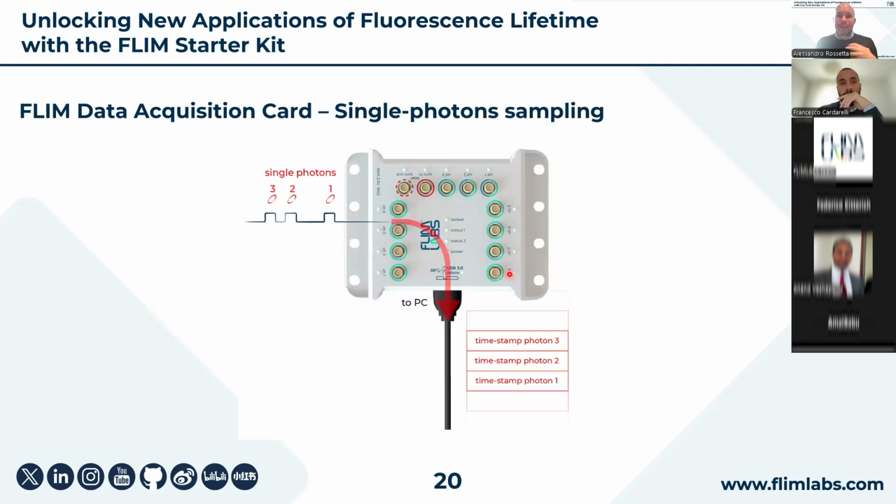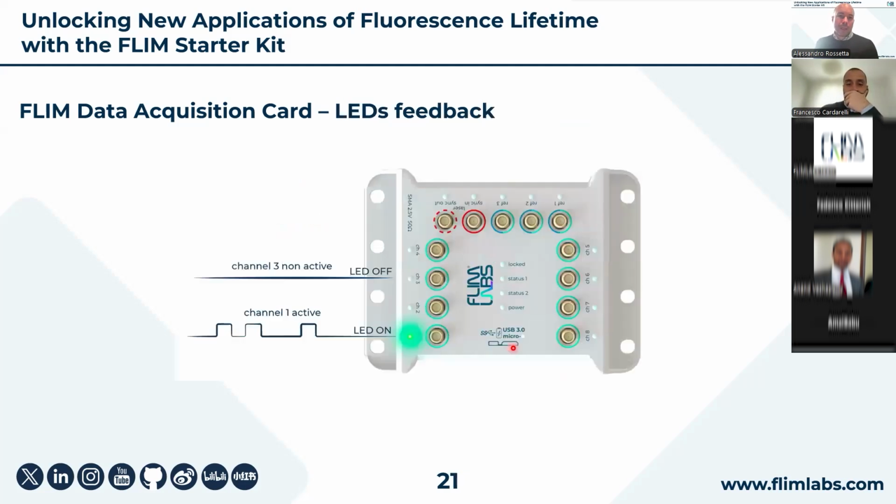For every digital photon that comes from our detector, the card sends a timestamp, according to the TCSPC principle, to the computer.